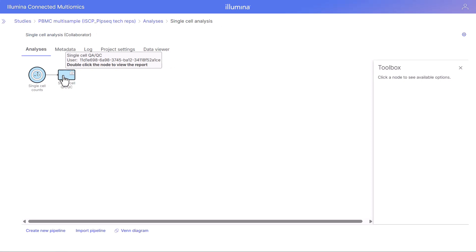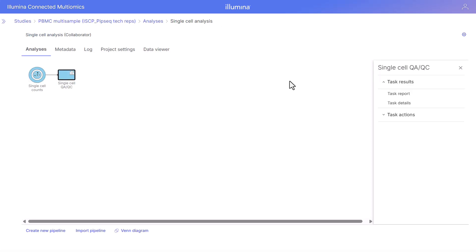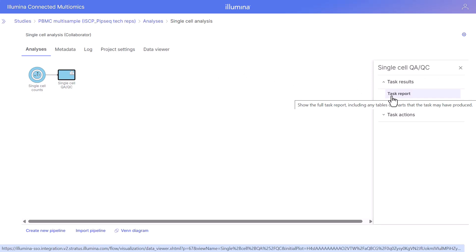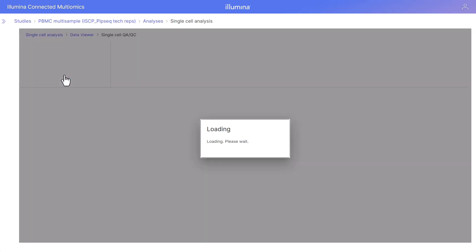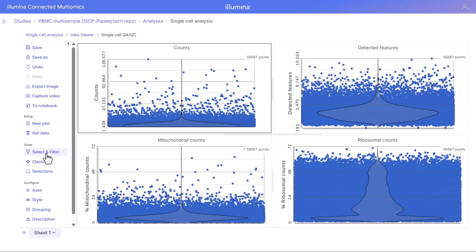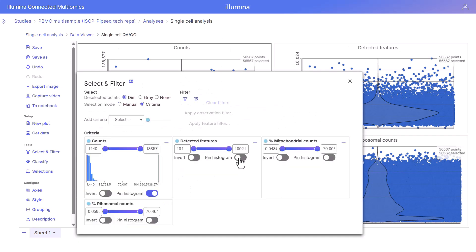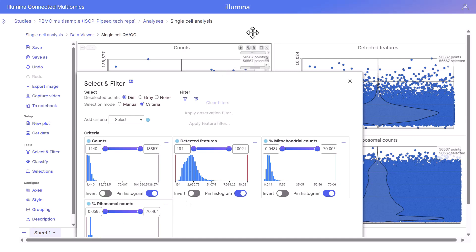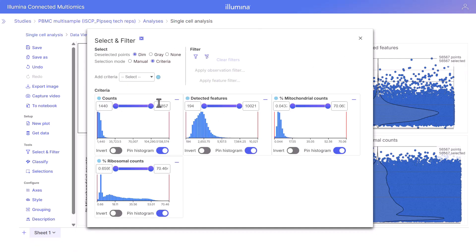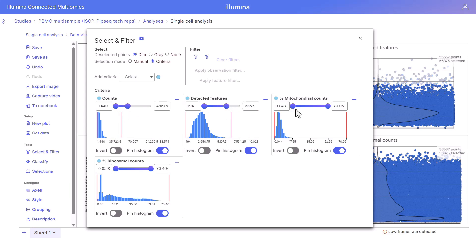The single cell QA/QC task has completed. We can single-click and open the task report in the toolbox, or double-click to open this output and view the results. We can use the select and filter tool in the left menu to open the select and filter panel to view these outputs and make selections for filtering our high-quality cells.